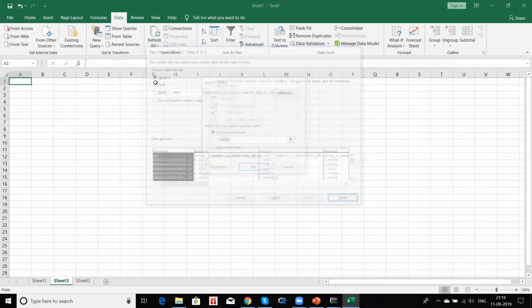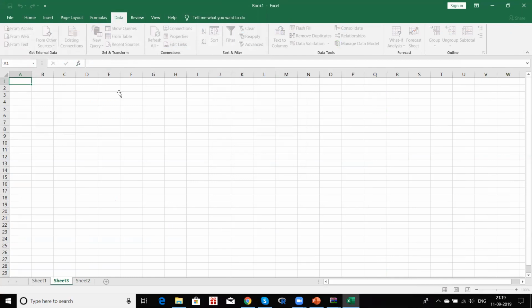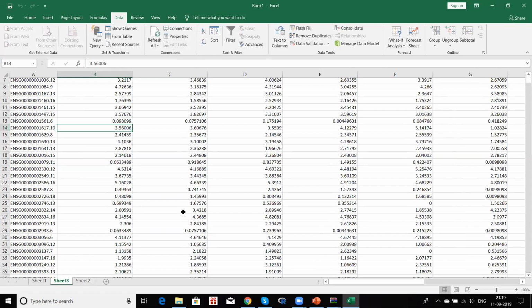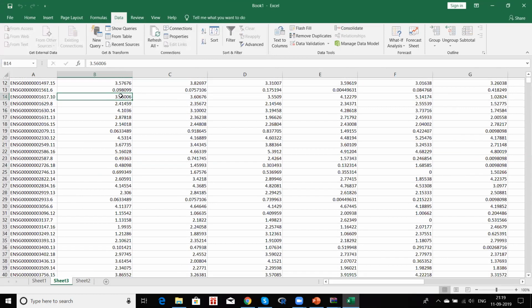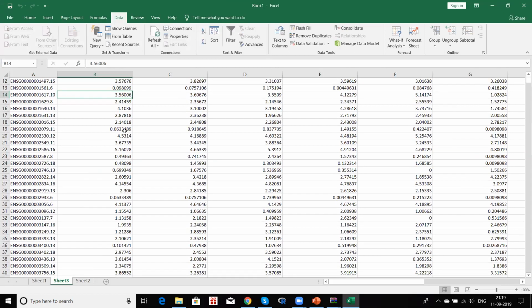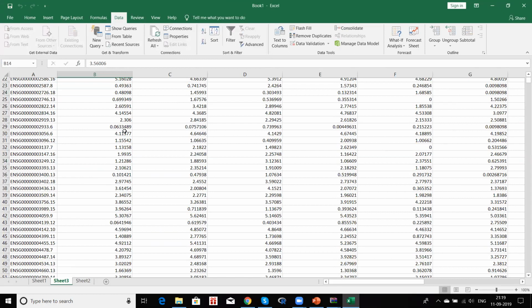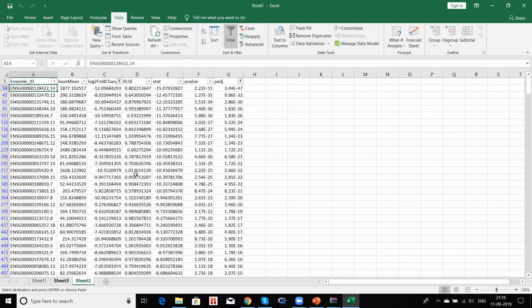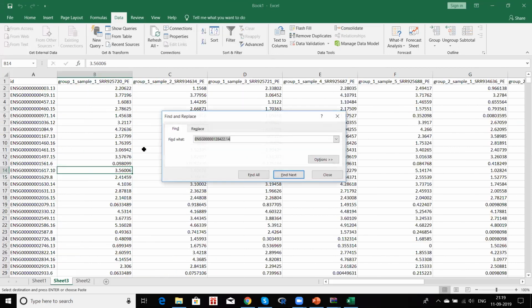So here you can see every file now has an expression level of 2, 3, 1, 4, 0 point something. So see, all those hundreds and 40s have now been transformed to 2s and 3s in a logarithmic fashion without the loss of any data. And that's a very important line. There's no data lost. So what we will do now is we will again copy this particular gene name. And now let's see what expression level it shows in this particular file, which is already log transformed.